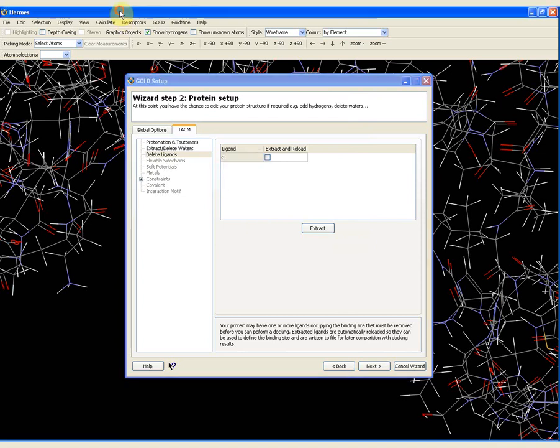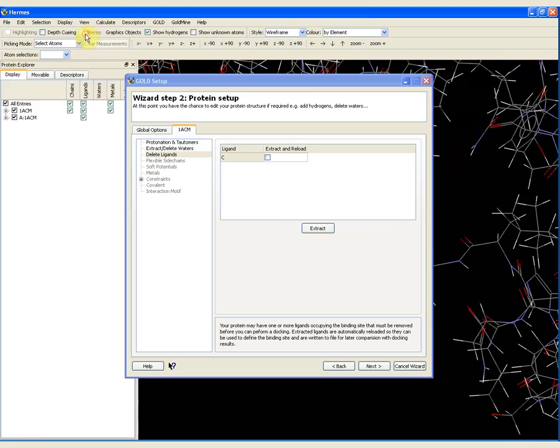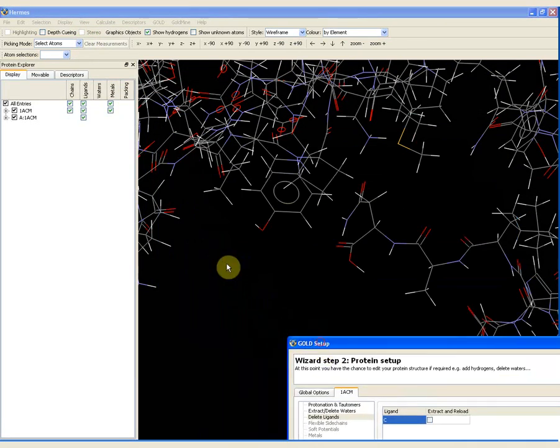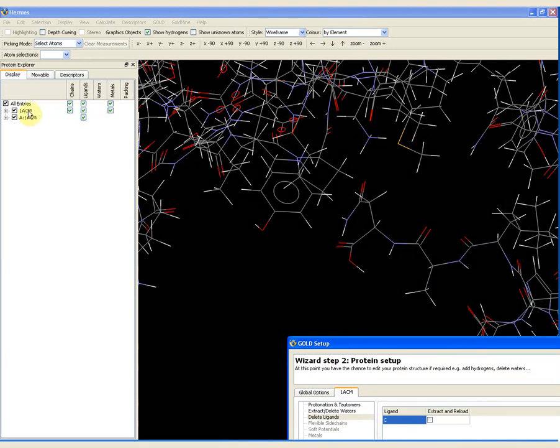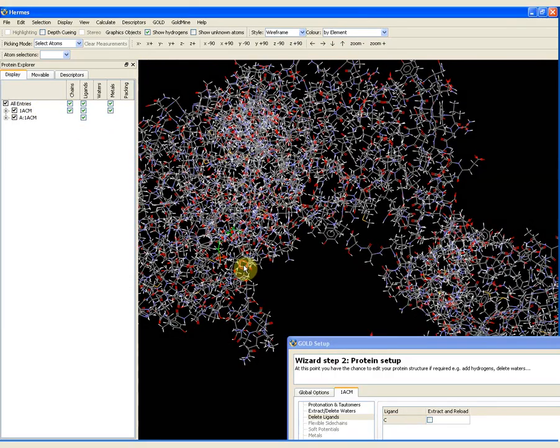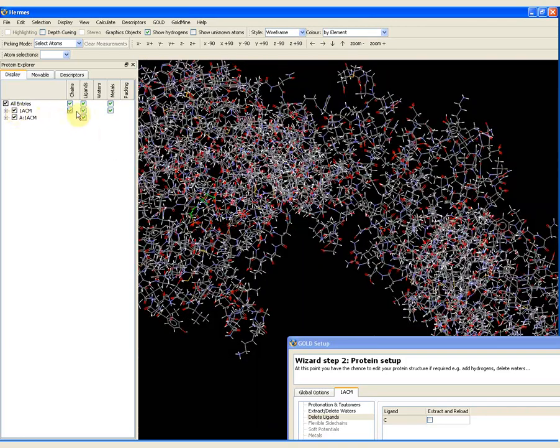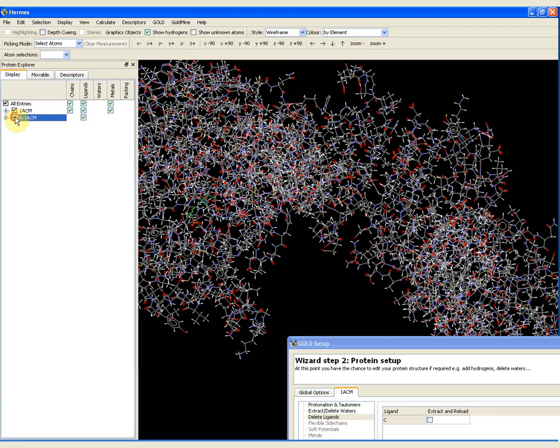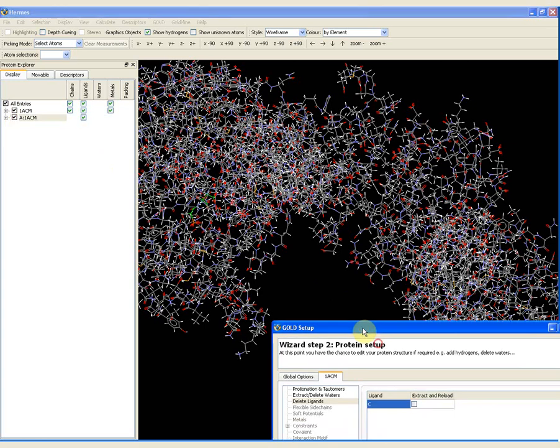Now, briefly going back to Hermes itself. If I click on View Protein Explorer, this turns on the Protein Explorer in Hermes, which allows me to look at the whole protein in greater detail. The protein file we loaded contains some chains, some ligands and some water molecules. If I untick the box, you can see that the whole thing goes away. And A1acm — this is the ligand that was added when I extracted and reloaded it. Using the tick box, you can see it is just the ligand.